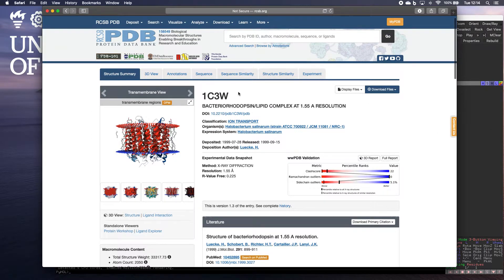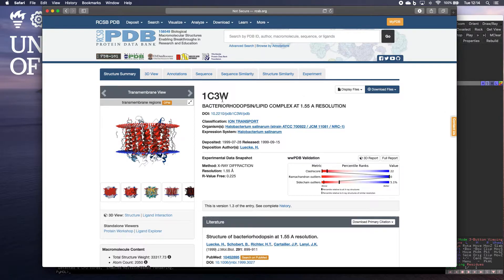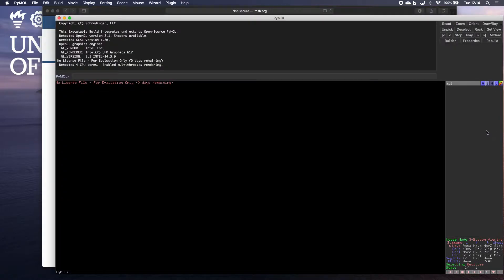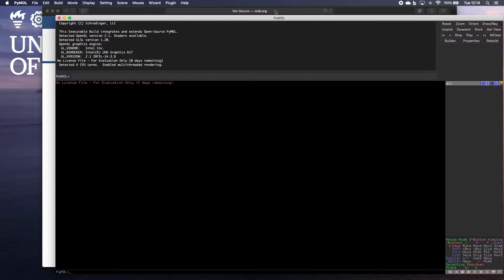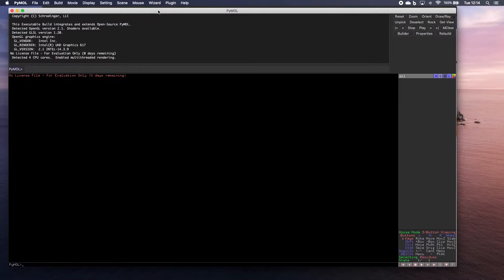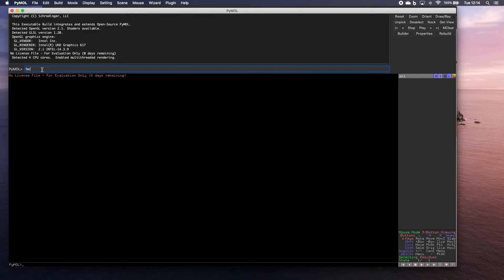So the simplest way to load a structure into Pymol is just to make a note of that number here. Go back to your Pymol screen. And then type in here, fetch 1C3W.